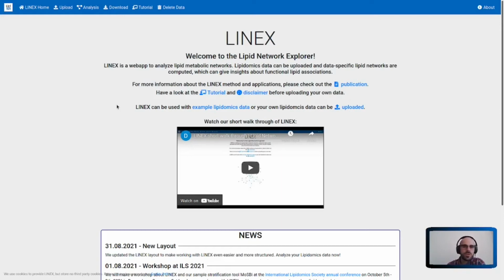Welcome to a short introduction to the Lipid Network Explorer. Here we're going to show you how to use LINEX, how to interpret the results, and give you a little bit of an overview on how to use the platform.